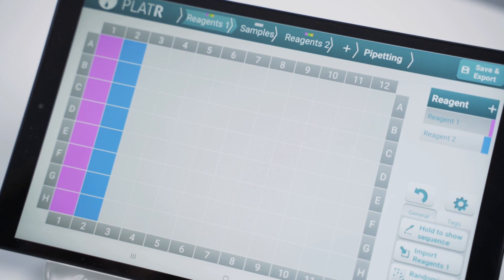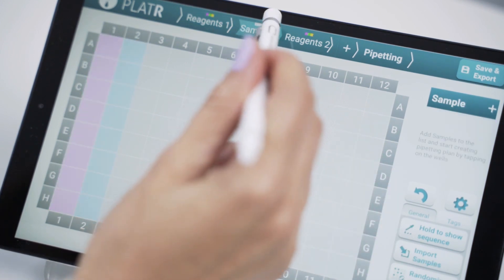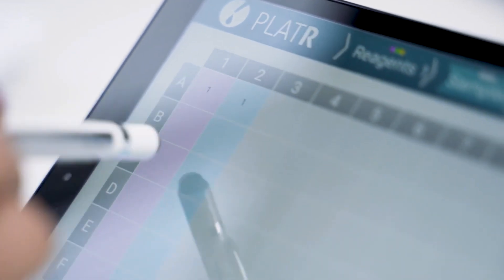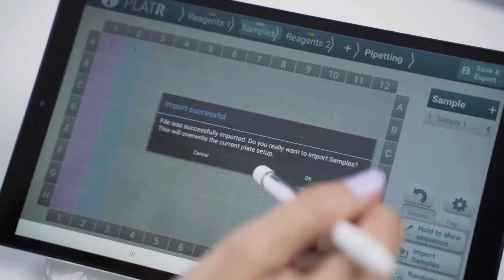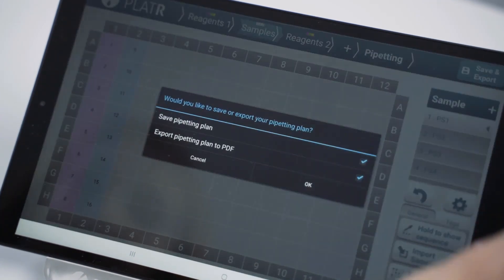You may always check that your sequence is correct. You can add samples one by one or simply import samples from an Excel file. Make sure you save your protocol before you continue to pipetting.